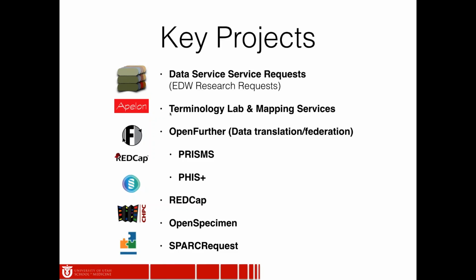And we hope to manage most of that as an aggregation type platform where we actually can harmonize and then generate analytical data sets. So we have great interest in actually pulling data in more near time from OpenSpecimen for people who are looking for, whether it's just for folks that have available specimens that do have a clinical record or just available specimens of a certain type.